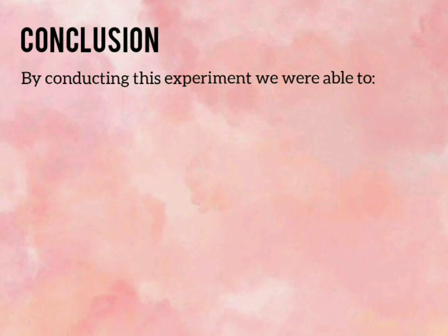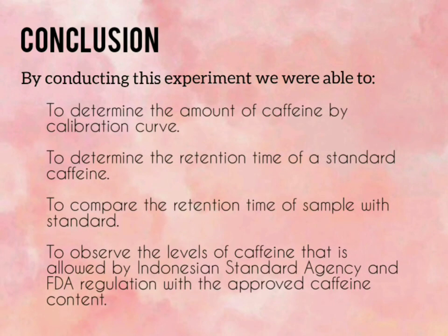And the last one is the conclusion. By conducting the experiment, we were able to determine the amount of caffeine by calibration curve. Besides, we were able to determine the retention time of standard caffeine. Next, we were able to compare the retention time of the samples with the standard. And lastly, we were able to observe the levels of caffeine that are allowed by the Indonesian Standard Agency and FDA regulation, with the approved caffeine content.